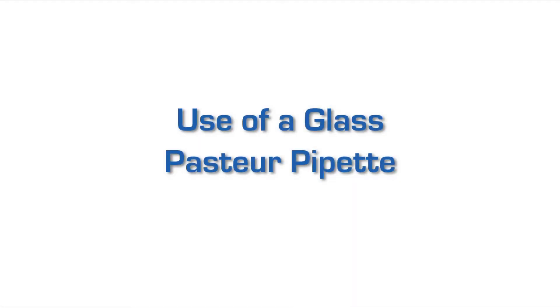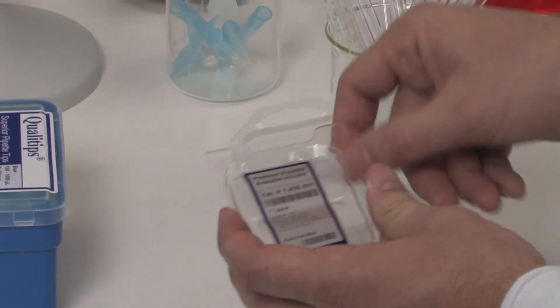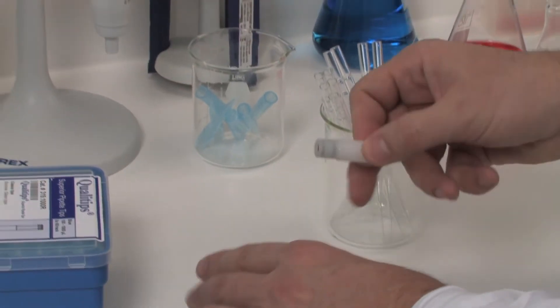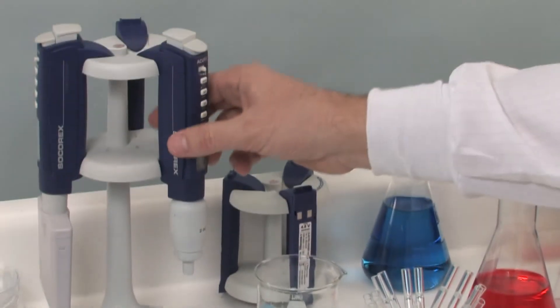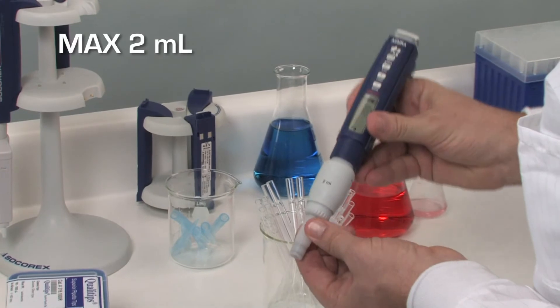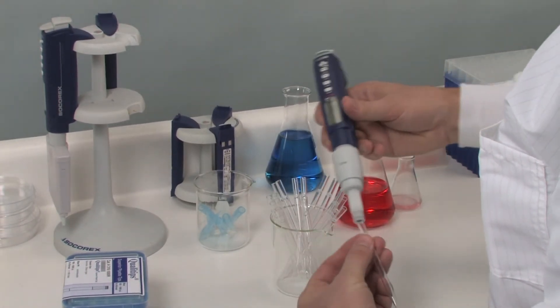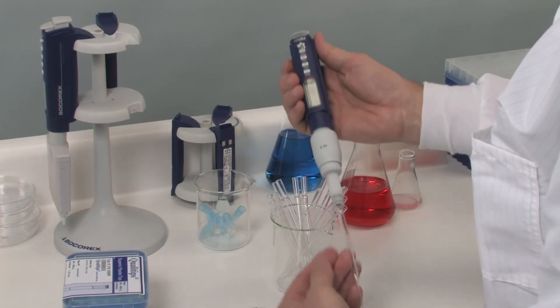Use of a glass Pasteur pipette may represent an advantage when transferring polypropylene-reacting solvents or when a long, thin tip size is required. A suitable adapter is available as an accessory to be used with the 2 mL model, and another adapter is required for the 5 mL model. Any pipetting mode can then be selected. Set the volume to a maximum of 2 mL, introduce the Pasteur pipette into the adapter, and start working as with a normal tip.